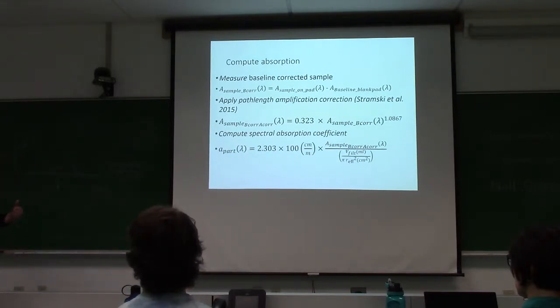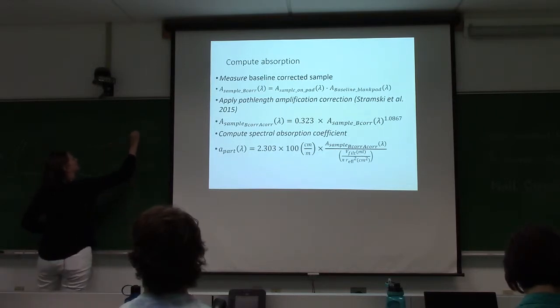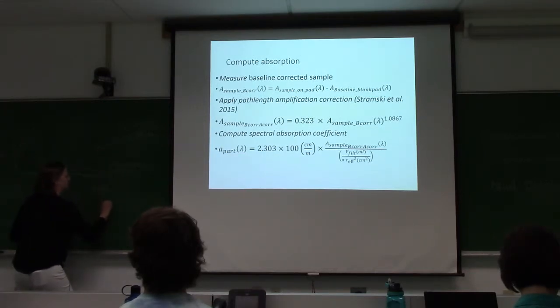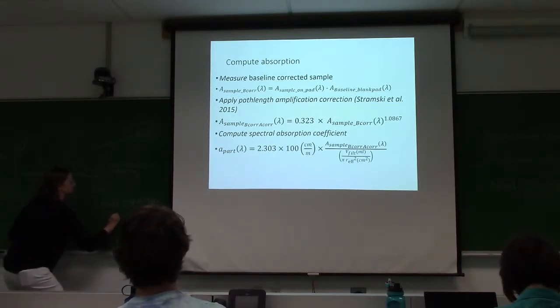And so in transmission mode, if this was the instrument that you had, what would you do? If you know that your instrument does not detect scattered light, and you know that that is causing an overestimation of absorption, and you know that phytoplankton don't have an absorption signal in the near infrared, how would you correct this? Just subtract it. That is called the null correction.